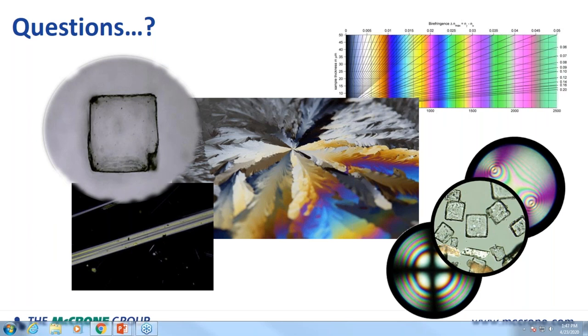You're going to get all kinds of characteristics. PLM is definitely useful. One of the clients I teach for often, that's all they do is starch and sugars. And they use a lot of pole scopes, and we go there and talk a lot about that. You can also identify a lot of those starches using plain polarized light based on the morphology, the size. Those are all good characteristics.